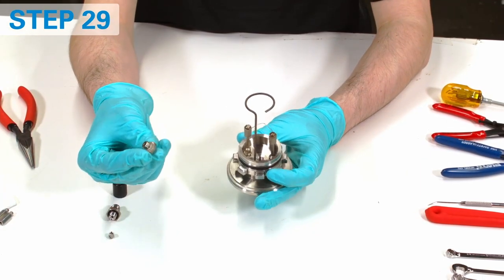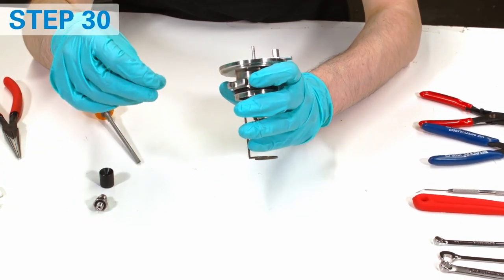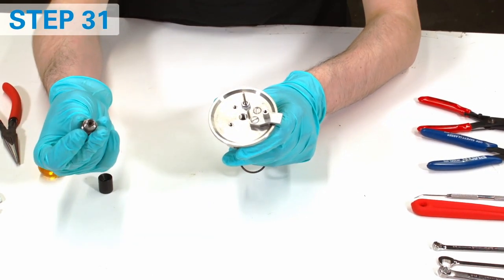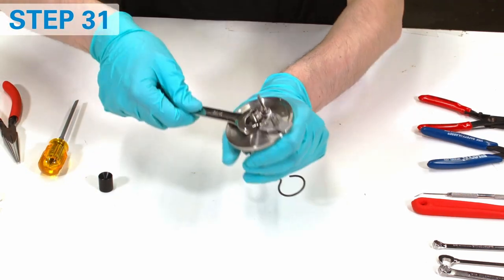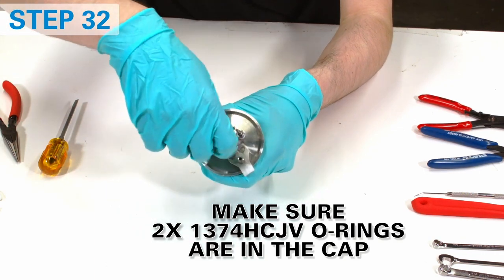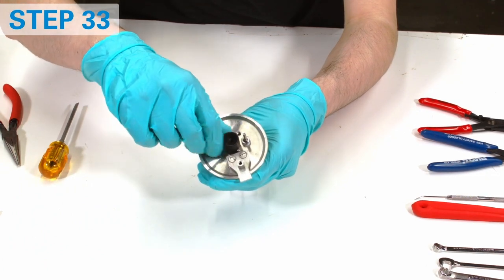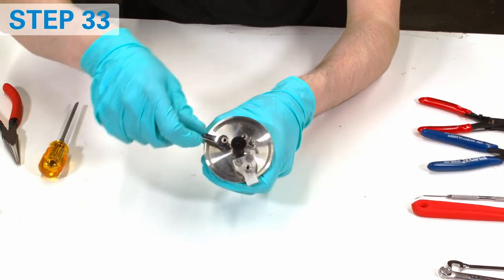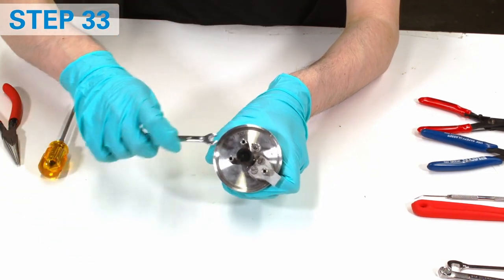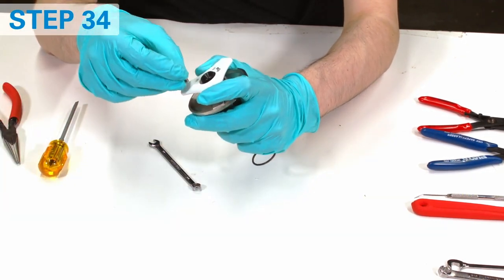Put back the water diffuser. Now put back the check valve — head down, pin up; otherwise it will not seal. Screw in the cap adapter and a funnel. Note that there are two identical o-rings stacked on top of each other on the top of the cap adapter. Attach metal standoffs. Put back the plastic handle and secure it with screws and a ground stud.